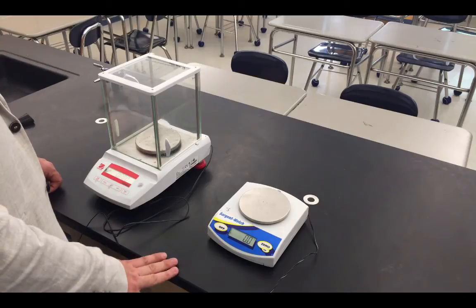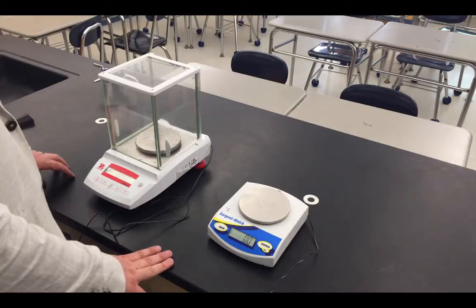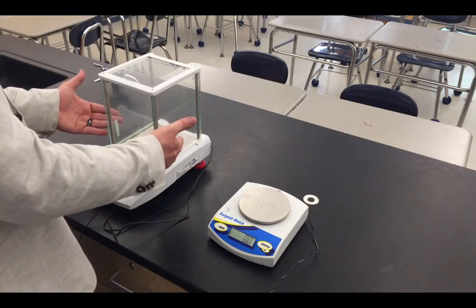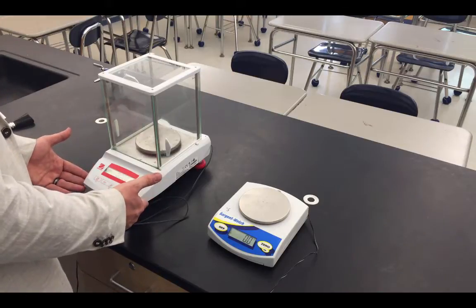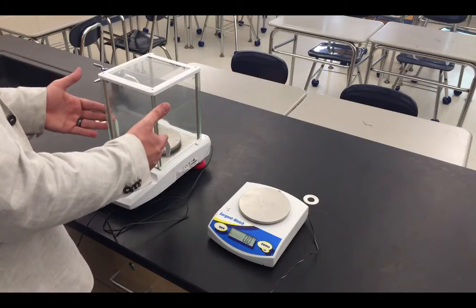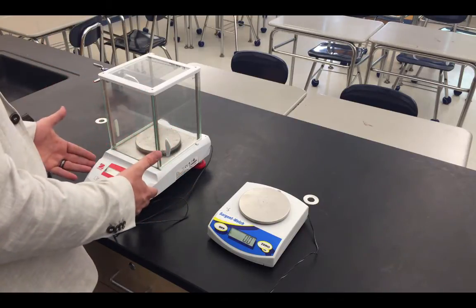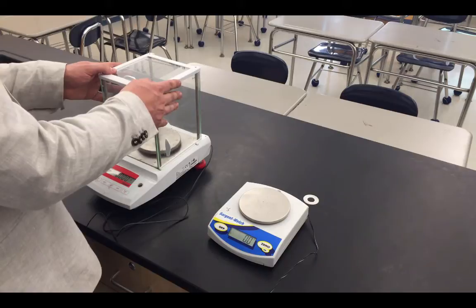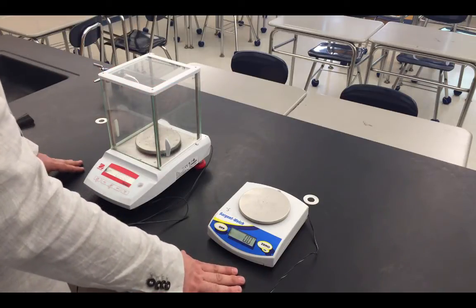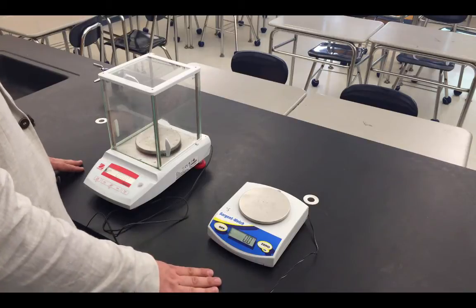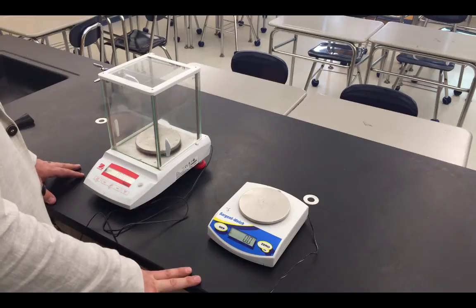Either device can be used in your experiment, it just depends on the precision you need in the measurements that you make. The last thing we'll point out about the two of these, the analytical balance has these glass doors on the side of it. Because this is so sensitive to small changes in weight, minor fluctuations in air movement from the room, i.e. someone walking by your balance, will cause this thing to give you inaccurate readings. The glass doors prevent that from happening. This balance isn't sensitive enough to detect those slight movements and as a result the glass doors are not necessary. At the end of the day though, both of these are reasonable devices to use to record the mass of a sample.